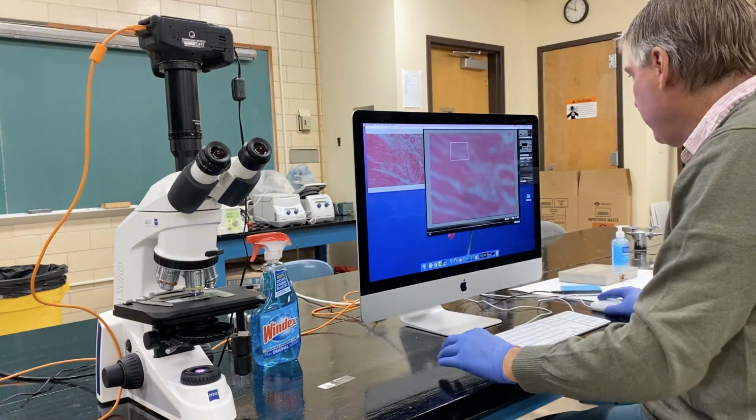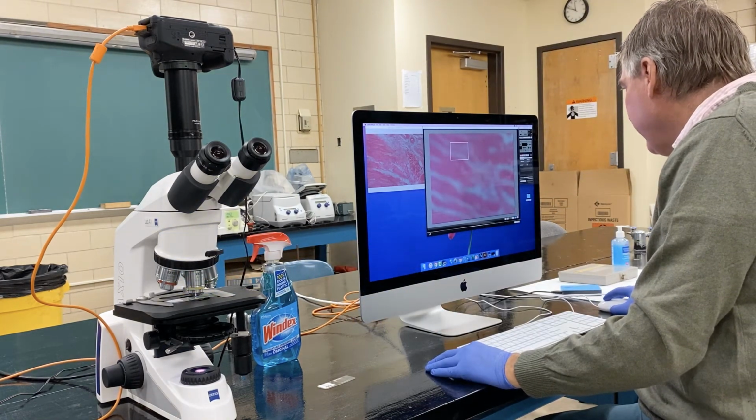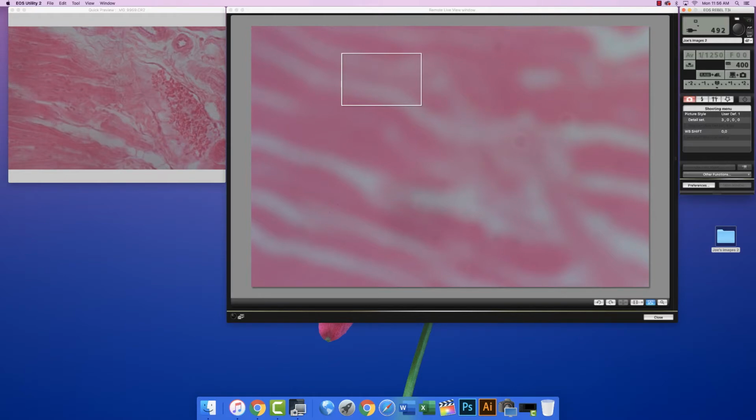This is the 10x exposure again. Now my ISO is at 400. I don't want that. My shutter speed is 1/1250, so that's really fast. So instead of using that shutter speed, I'm going to double click on the ISO and bring us back down to ISO of 100. And now when I mouse over the shutter, I'm still at 1/320, so that's a little higher than I would like.